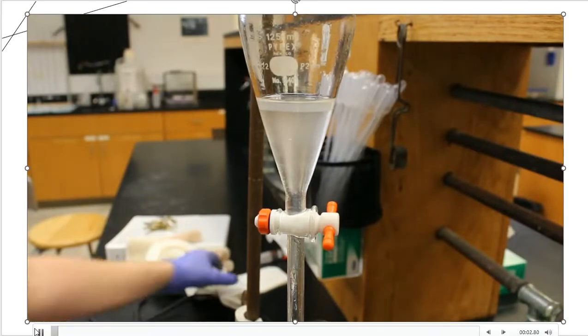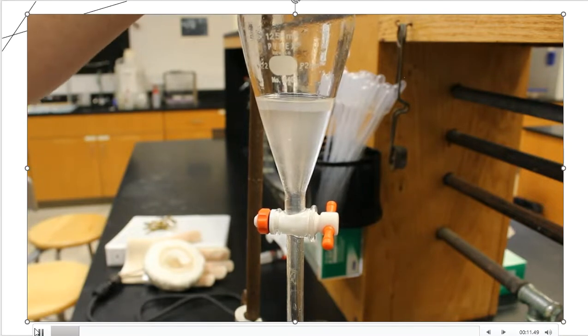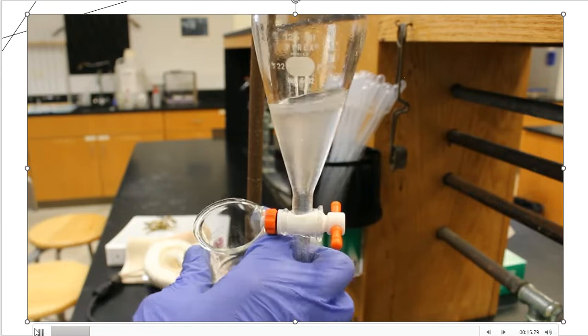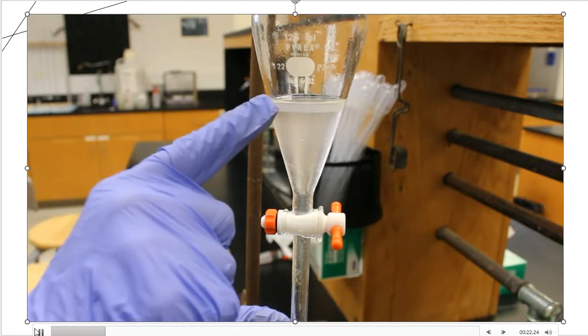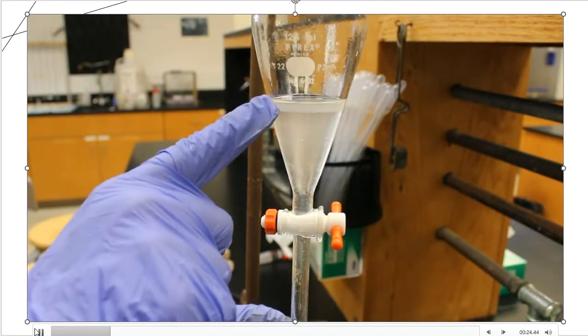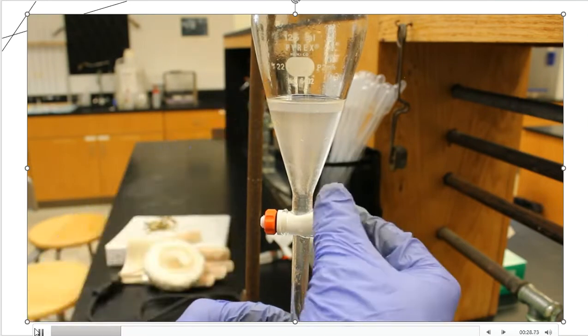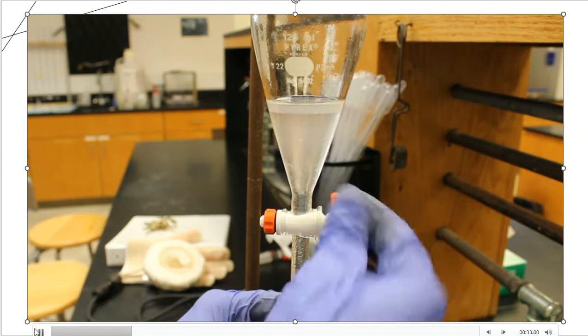All right, so once again, I'm going to drain the methylene chloride layer. I have to because I've got another separation step, and that involves saturated sodium chloride this time. So I'm going to take the lid off the separatory funnel. If I do not do that, it builds up pressure and it will never drain. Now this is your sodium hydroxide from the previous step. I only added 5 milliliters. That's the tiniest layer. So that is the sodium hydroxide that we need to get rid of.